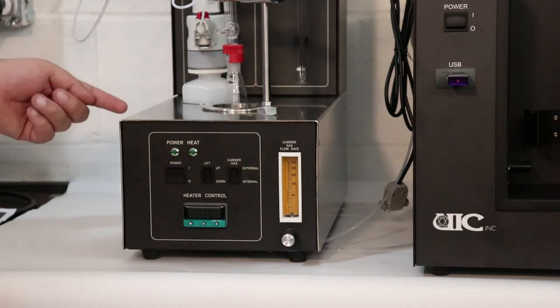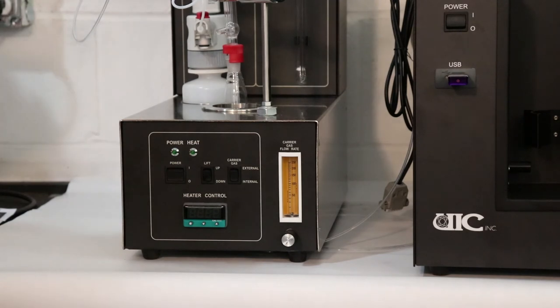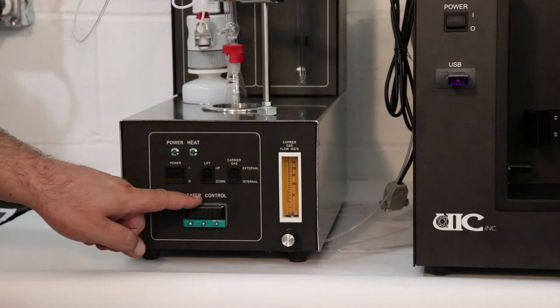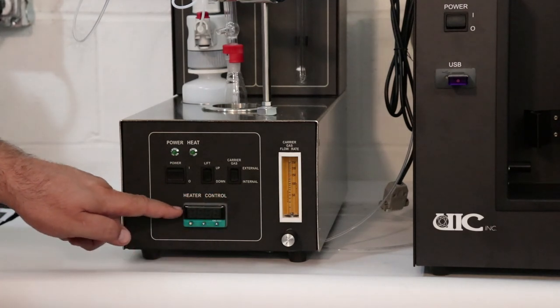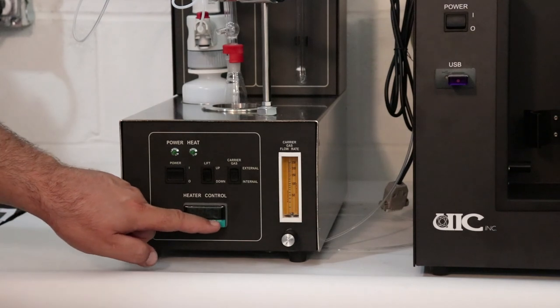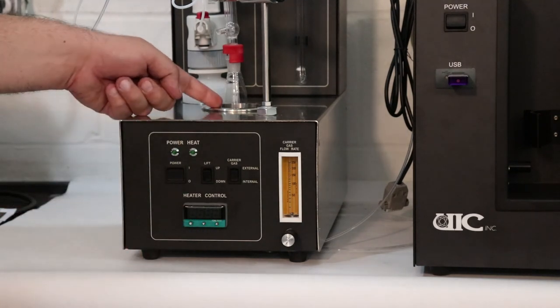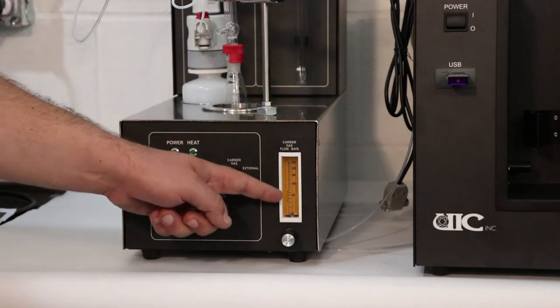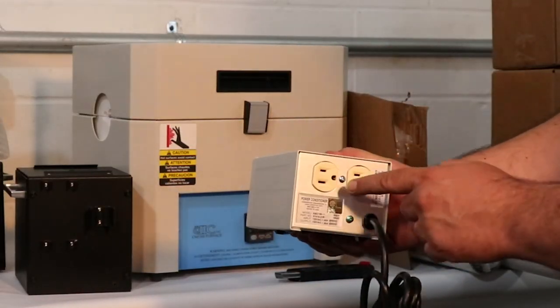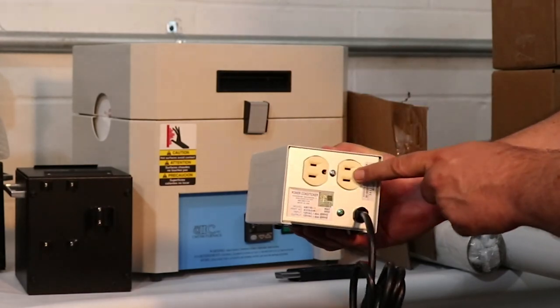Connection for the external gas source is in the back of the acidification unit. This is a temperature controller. To adjust temperature, press and hold the left button and use the middle and right buttons to lower and increase temperature respectively. Set the flow meter to 100 milliliters per minute. Only the coulometer should be connected to the power var even though it has two outlets.